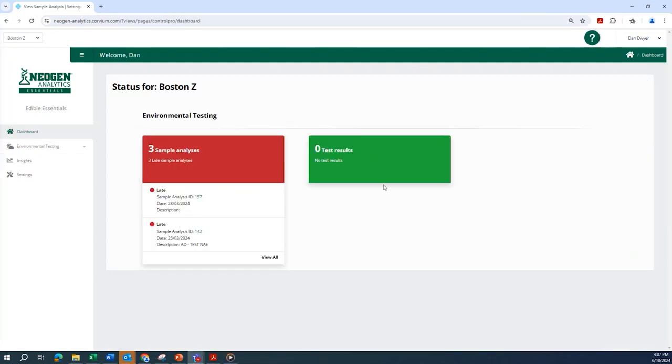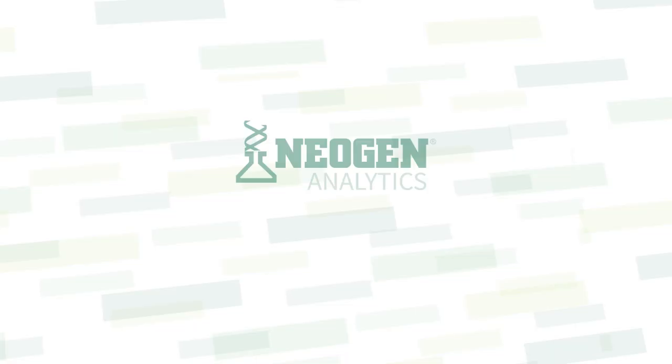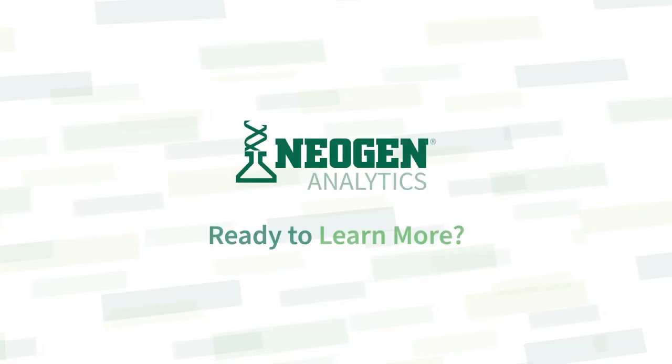Support for all functionality is provided right here in the application. Videos, user guides, and help requests can all be accessed with a click of a mouse. For more information and support, please contact your Neogen representative today.